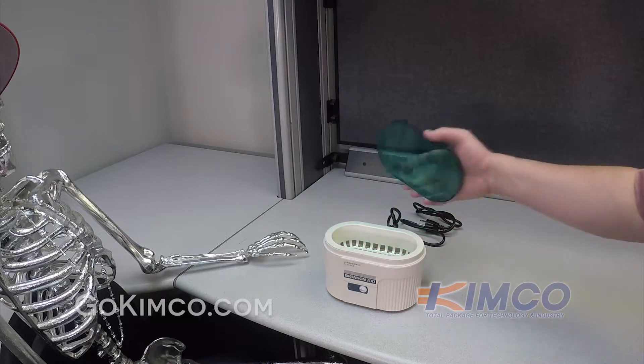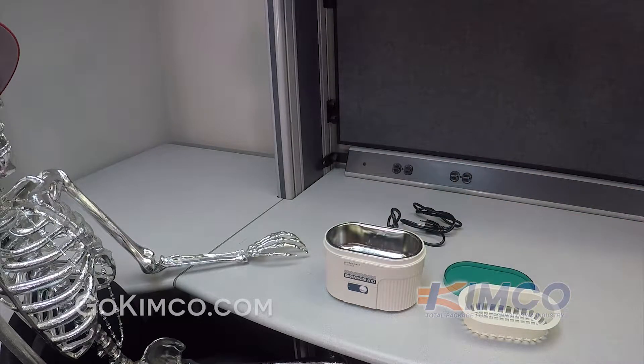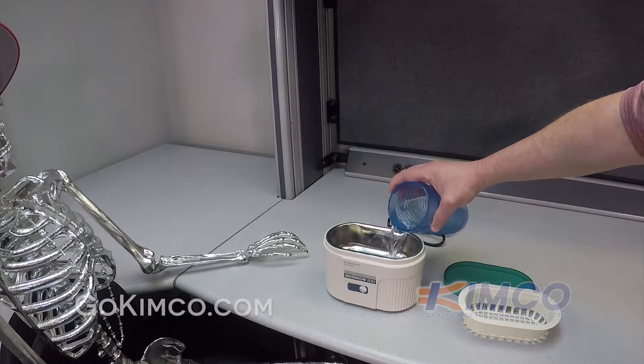We're going to add solution. First take the lid off, then we're going to take the basket out, and we're going to add solution. That solution happens to be water, so in this case we'll add water.